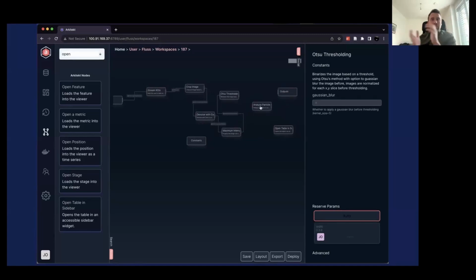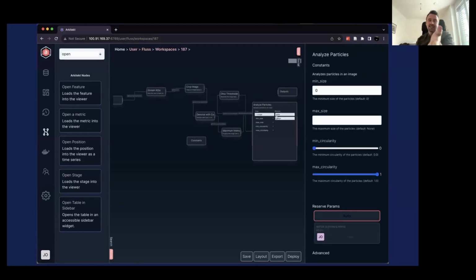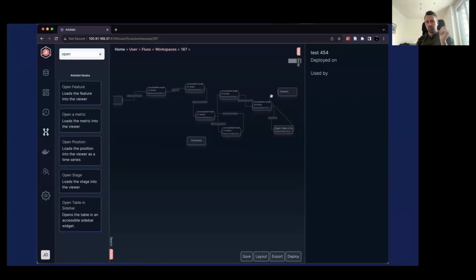As we all know, bioimage workflows are not that simple. There are a lot of parameters that you often have to fine tune, but you can set parameters, for example the plugin parameters, already in this online workflow. Once you save them, they will be applied to every image that you run in this pipeline. And you have a predictive way of saying what should happen when in my workflow. So that's a way of constructing it. This process has also been completely streamlined in a newer version of Arkitekt, but I'm presenting you the old one.